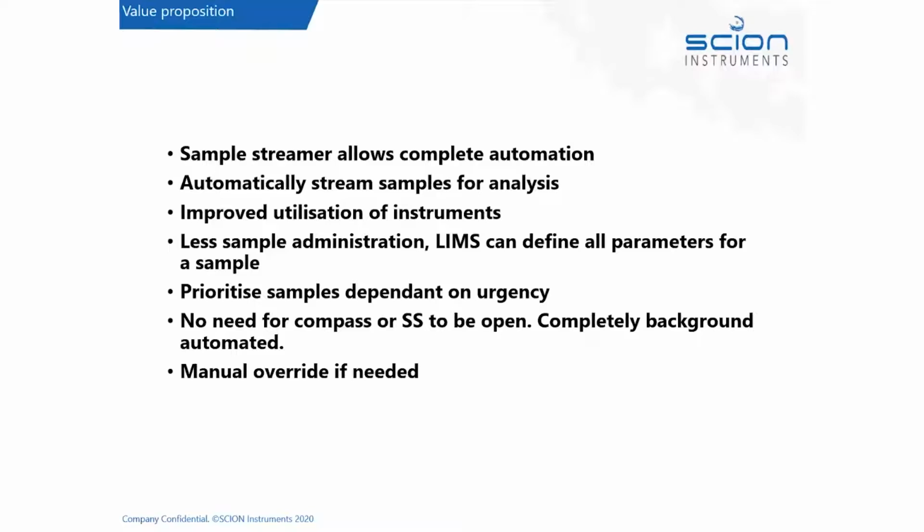You have that full control and flexibility. I should mention that depends on your level of user permissions. If you don't have the user permissions to do that, then I'm afraid it would not be available to you. So we do have an eye to compliance as we do all of these things.